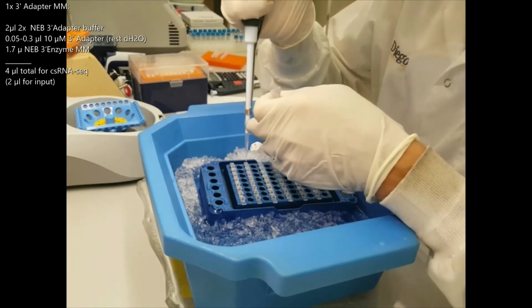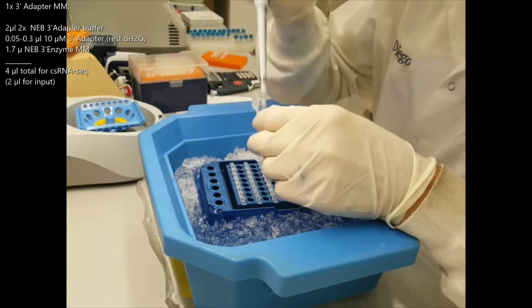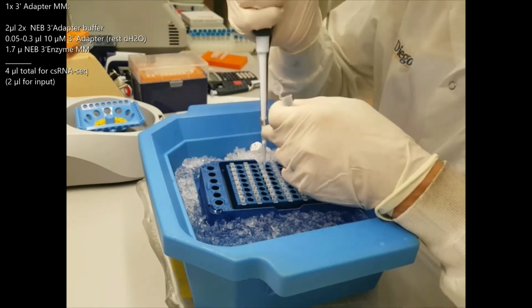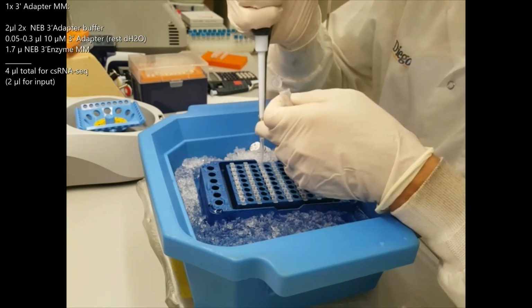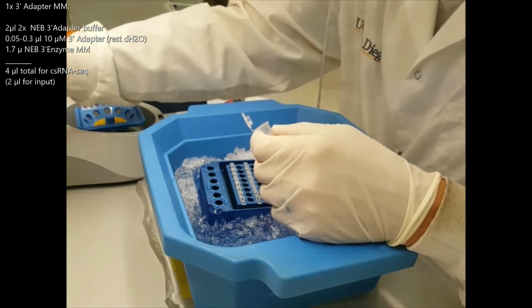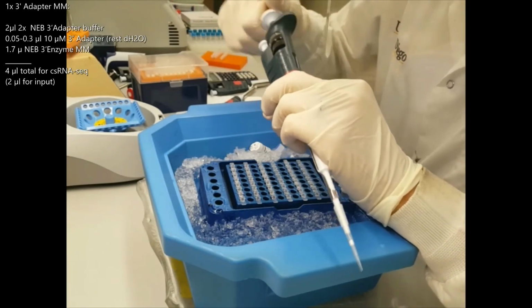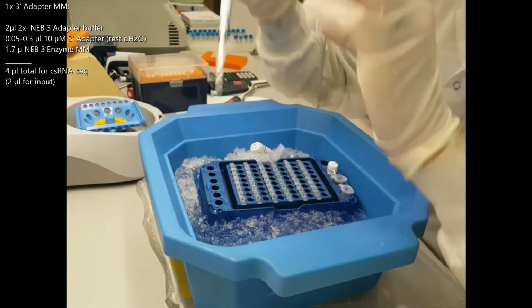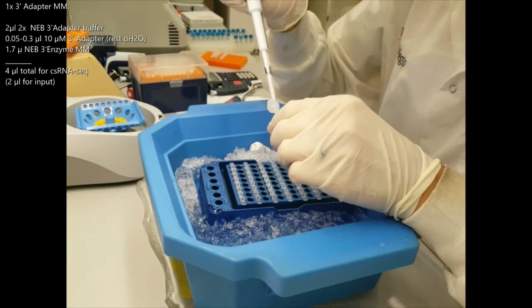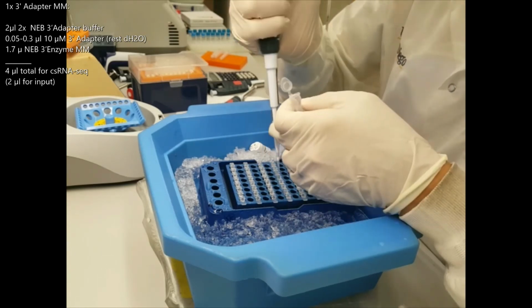Here it is critical to know that the amount of adapter concentration relative to the small RNA determines the amount of ligation efficiency as well as of adapter dimers. While we use hybridization to deplete adapter dimers, if you find yourself ending up with too many adapter dimers, reduce the amount of 3' adapters. For example, with patient RNA, where I sometimes have less than 500 nanograms, I use 0.1 microliters, or sometimes even 0.05 microliters of 10 micromolar 3' adapter.